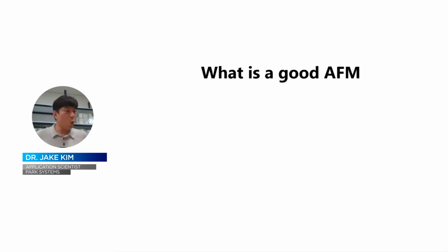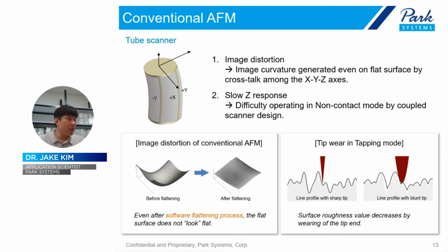Next, let's talk about what a good AFM is. Since AFM was developed, there have been many trials to make better performance, to make the best AFM.